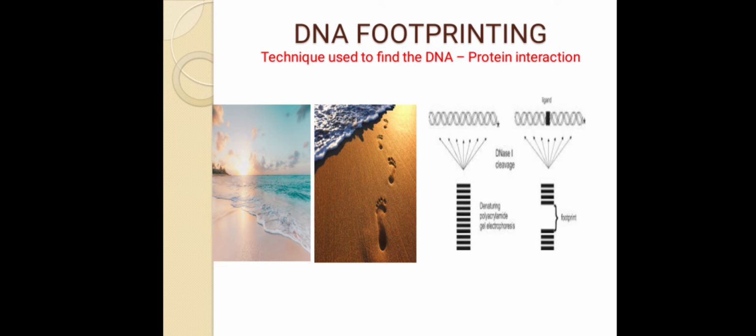Then look at the third one, a pure DNA molecule. Then the fourth one, a DNA molecule with the protein, the black spot. So it symbolically represents that DNA is interacting with the protein, like the footprints on the beach.